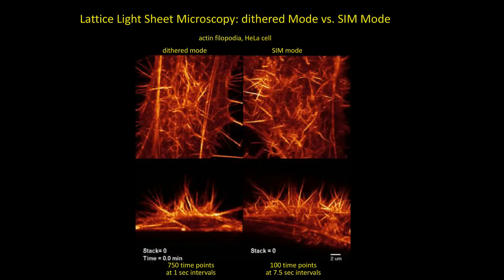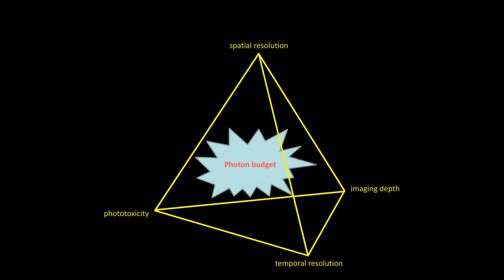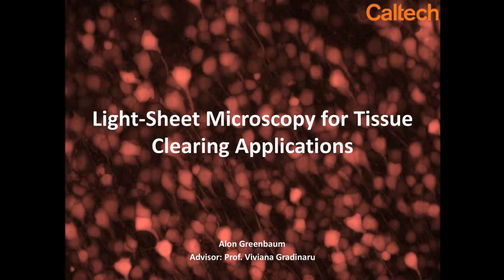So we will go back to our final slide. Again, this world is a compromise, a lot of trade-off between the spatial resolution, temporal resolution, and also the imaging depth. The imaging depth, which I didn't cover a lot in this part, still has a lot of research going on, using the light sheet and imaging even deeper tissue, for example, brain tissue, so we can get very fast imaging of the entire 3D brain construction.